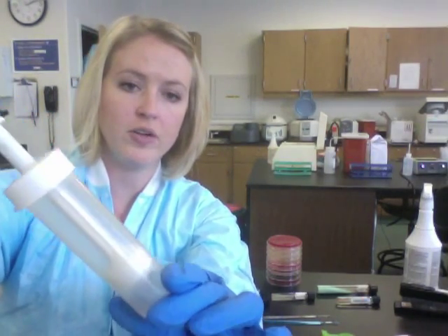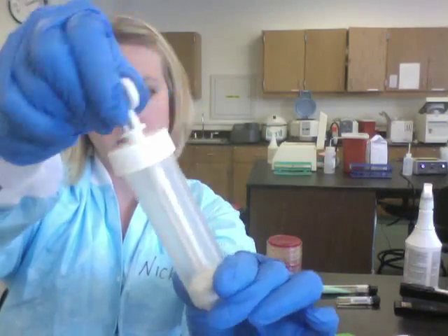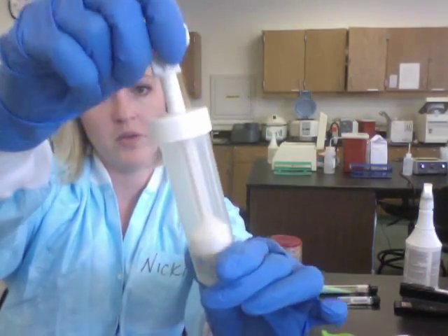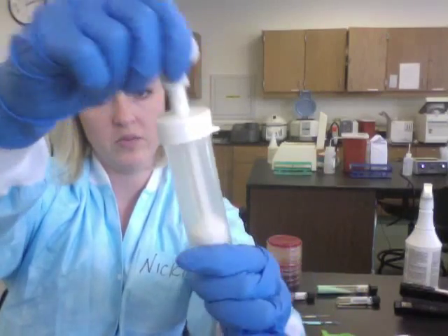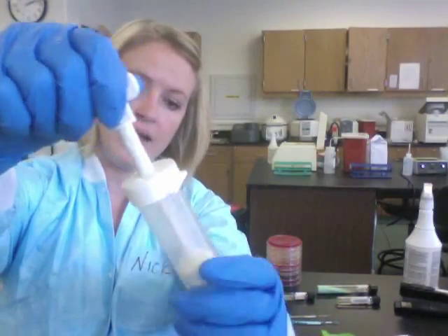Now you have an apparatus that looks like this. You're going to use the top part — pull up and grind. You're going to grind back and forth, picking it up and grinding repeatedly, until you have a very homogeneous mixture of saline and tissue.